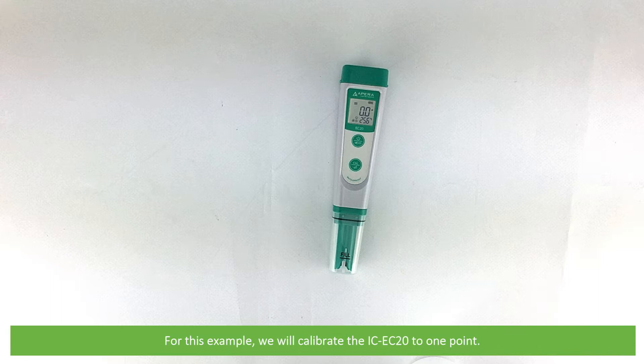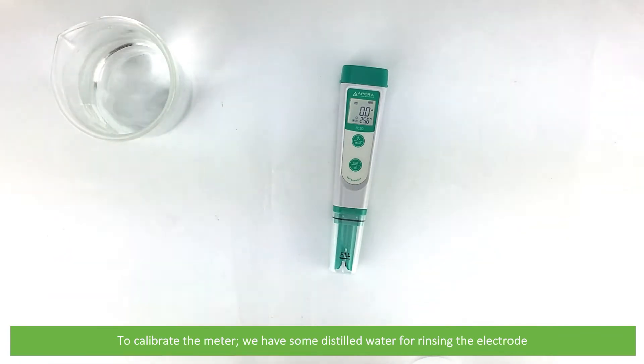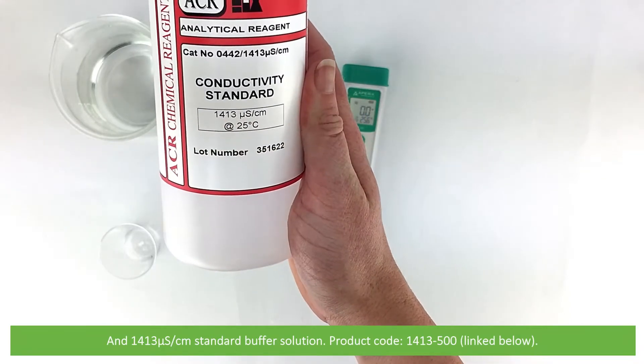For this example we'll calibrate the IC EC20 to one point. To calibrate the meter we have some distilled water for rinsing the electrode and the 1413 microsiemens per centimetre standard buffer solution.